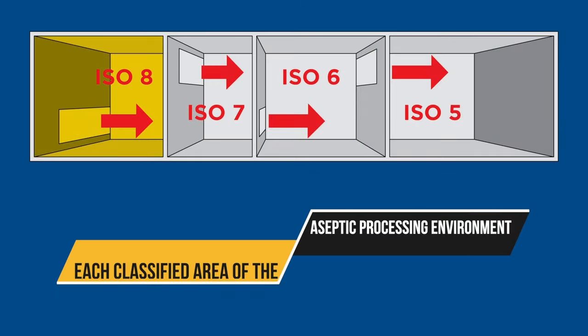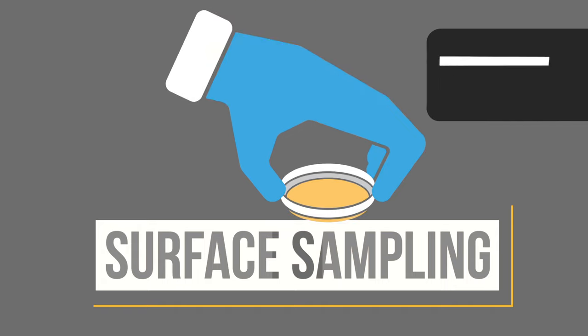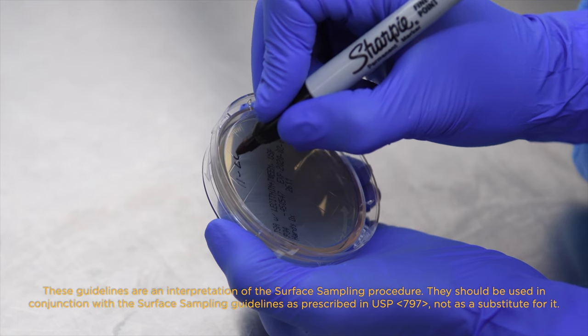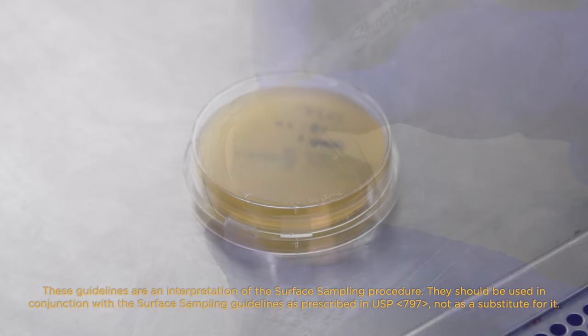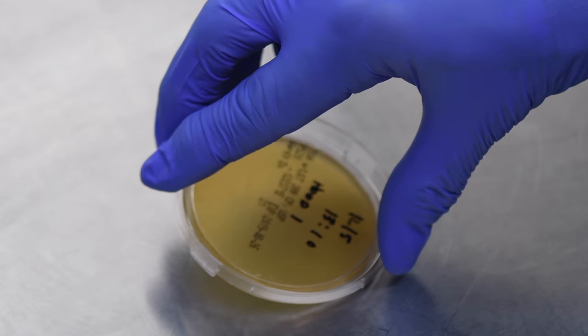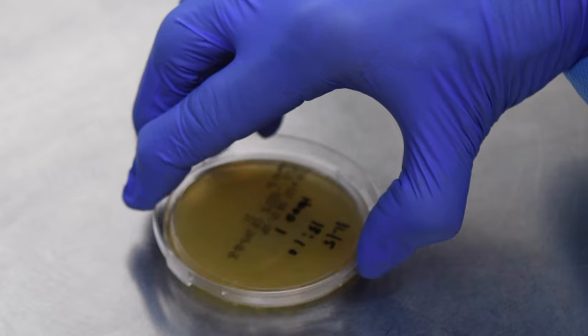Each classified area of the aseptic processing environment must be sampled. The procedure per USP 797 is as follows. Label the sampling device with a sample location and sample date. Remove the cover from the sampling device. Using a rolling motion, firmly press the media onto the surface to be sampled.